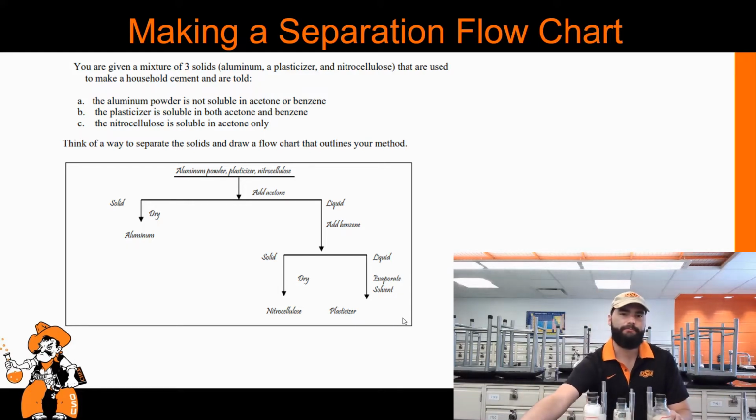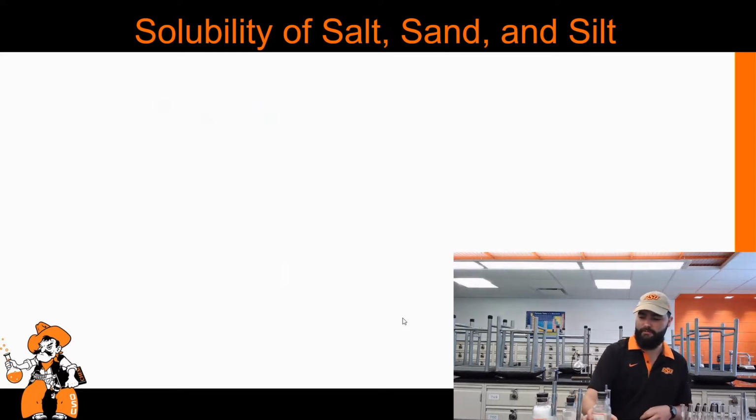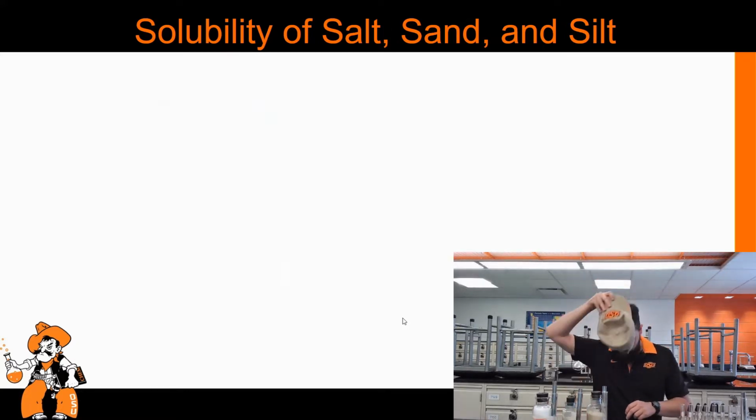Before we can separate out a mixture of the 3 components, we first have to figure out the solubilities of each of the components. Before we start testing the solubility, go ahead, throw my goggles on.